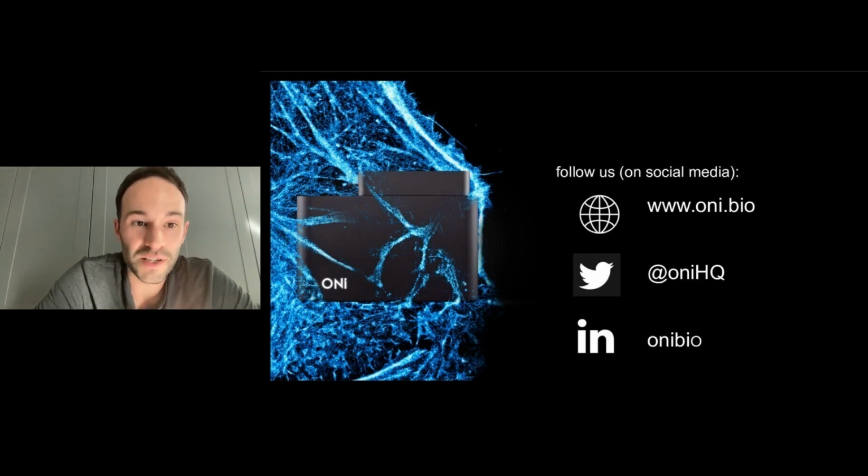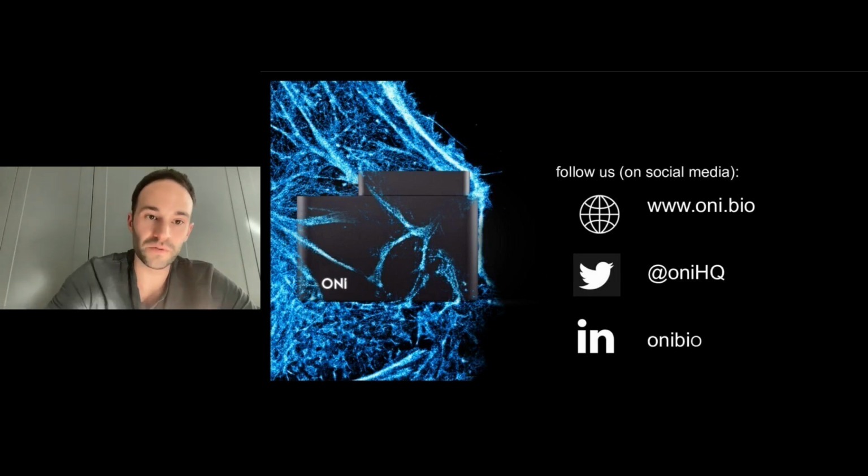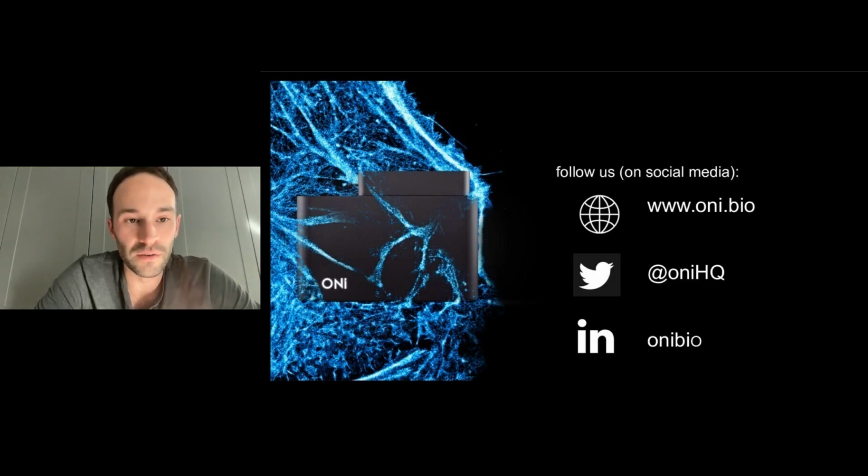However, compared to other systems, we don't actually need very much drift correction because it's an extremely stable system and there's very minimal drift. Particularly if you were doing something like live cell imaging, the main thing would just be to let the system equilibrate to 37. And once it's done that, the drift is very minimal. And actually for live imaging, the spatial scale of any potential drift will probably be well below what you're actually interested in.